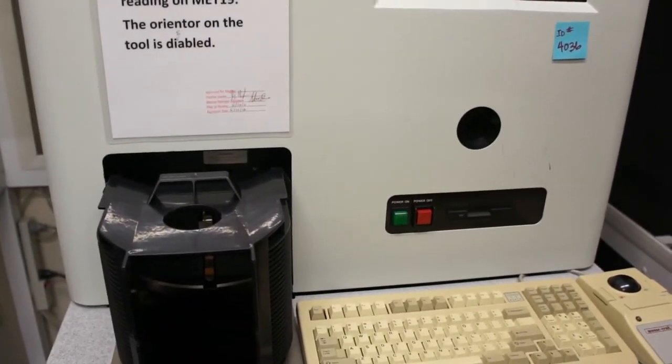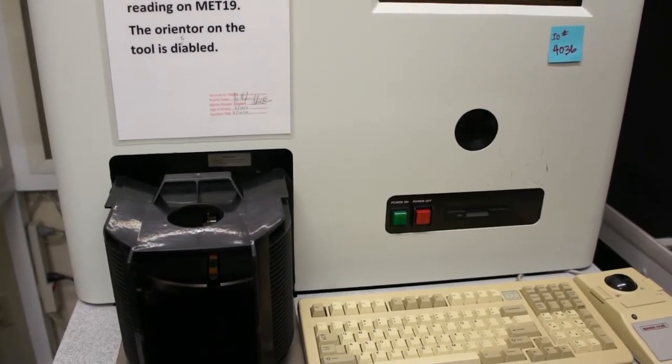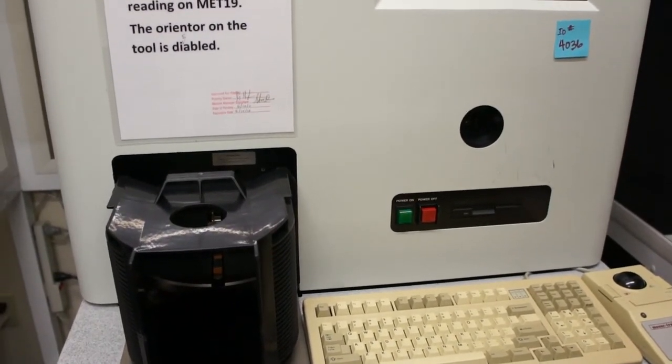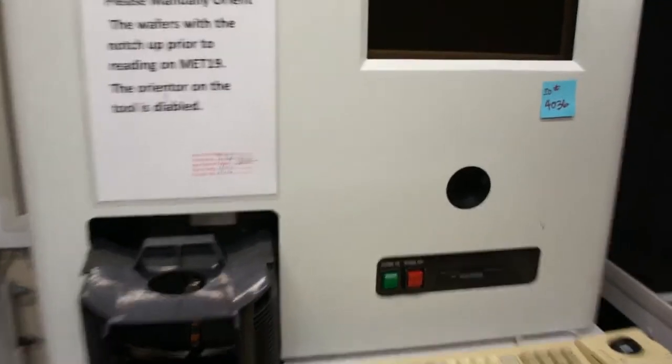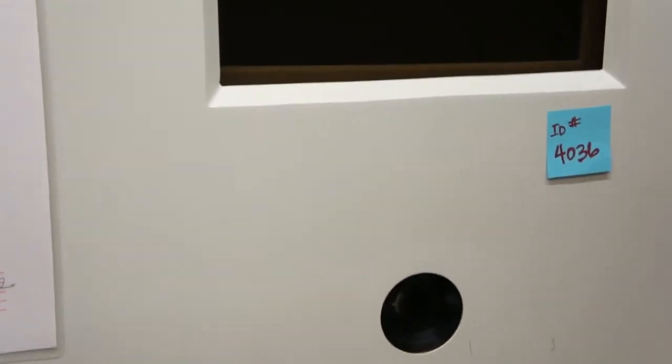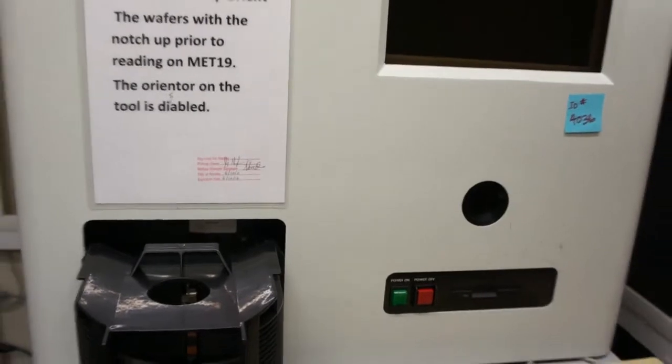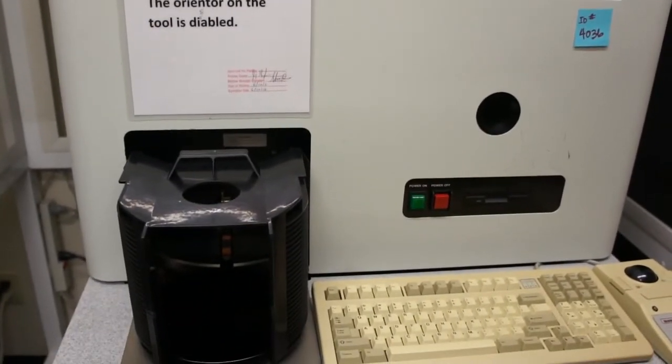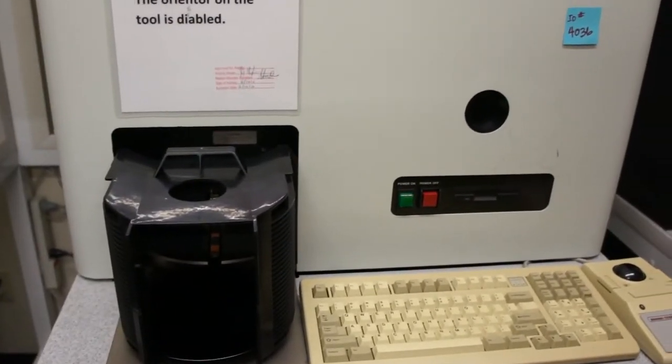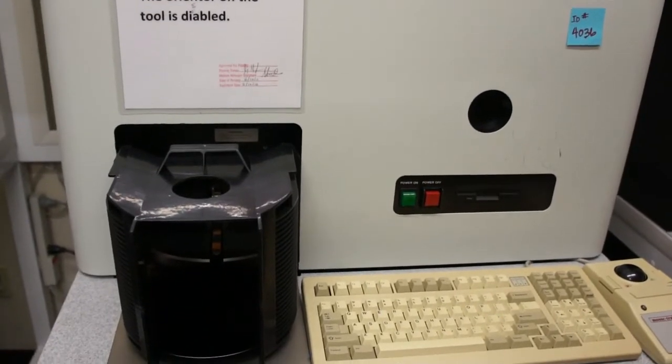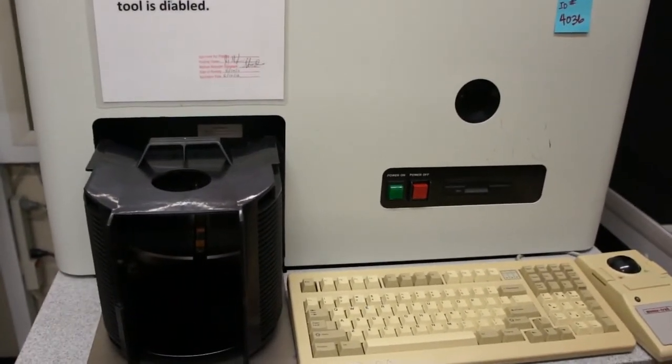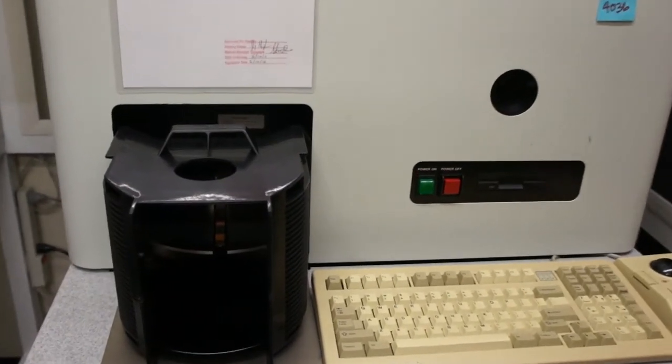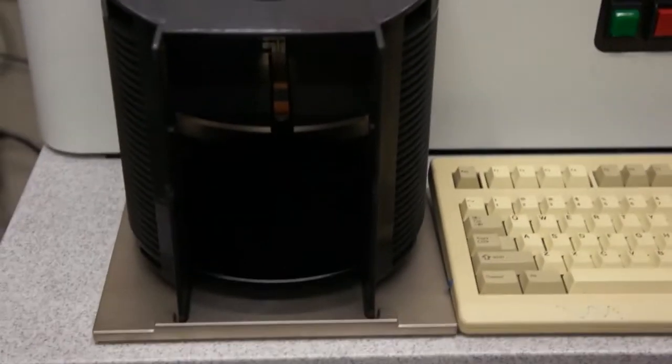Today is October 25, 2015 and this is class 1's FLEXUS 5400 ID number 4036. This is going out with 8 inch wafer capability and this portion of the proof of life video will demonstrate the functionality with the wafer handler and measurements with an 8 inch wafer.